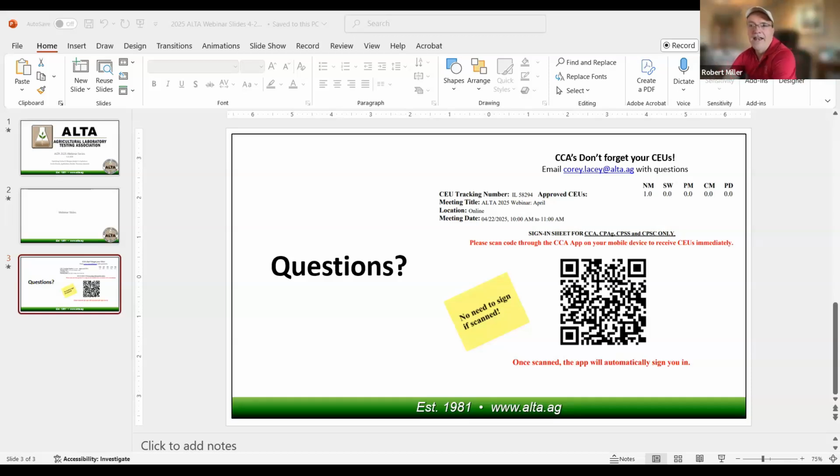So any questions? Yeah, so Bob, I love that, and I'm glad that you two are the people saying you need to grind to 0.5 millimeter, because I know that's not a popular statement with some labs. But I think we need the data to say this is necessary so that we can justify the cost as a lab when we go and talk to the people paying for this carbon analysis, because it really gets to the real issue with labs, which is that there's a stool set up, right?